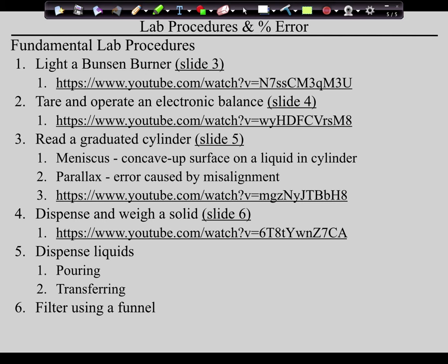Okay, so here's the idea, guys. Let me set this scenario for you. You're in lab and you need to get 10 milliliters of whatever is in this bottle. I know you have no experience, so let me paint the picture for you. What we will do in lab is always put all of the chemicals on that table up front, where we had the fire extinguisher and stuff last time. Everything will be up front. But in some labs, there will be 30 bottles up here on the front table, sometimes more.